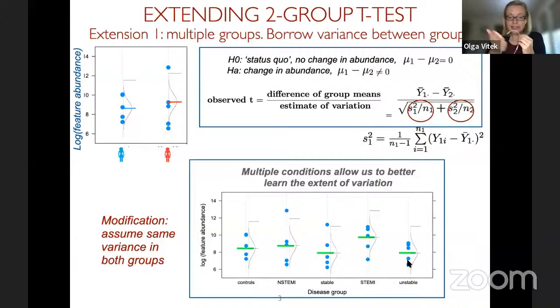If they are not, such as in experiments with TMT, as we will discuss, then we need to do something else. So yes, we can fit ANOVA models, but only for the experimental designs when this is actually appropriate. And the good news is that MSstats does a lot of parsing in the backend to figure out which model is actually appropriate for each experimental design. But this is the use of the analysis of variance potentially.